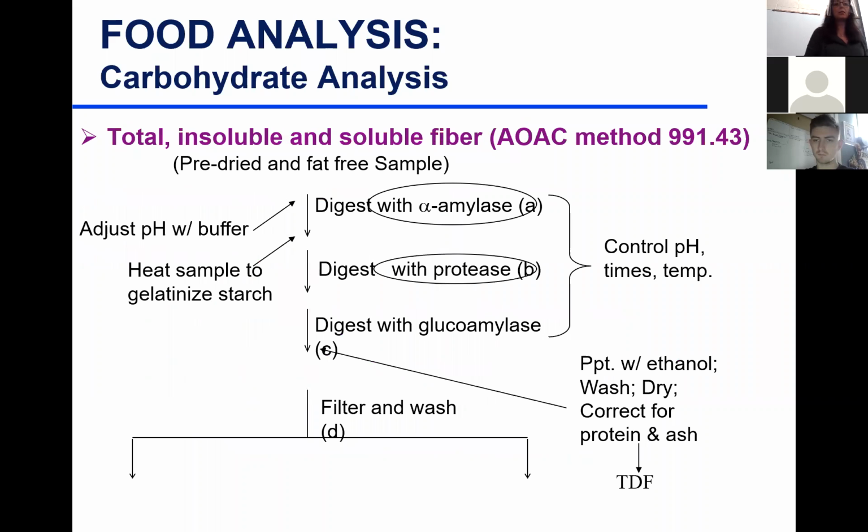The methods that are used are dietary fiber approved methods of analysis, which are your AOAC methods of analysis. So it's very tedious. Ask my lab group members. They don't like measuring dietary fiber.